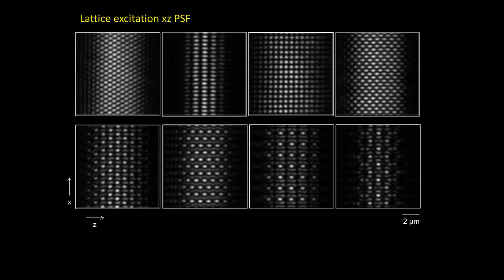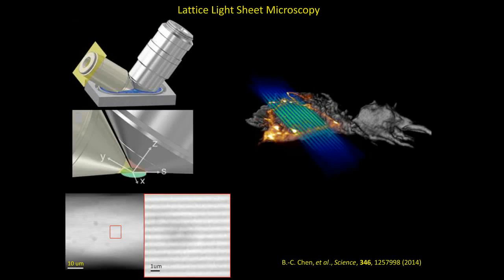And these are very good for structured illumination, because we know structured illumination needs certain frequencies, and these are all the frequencies from the lattice pattern, which is very good for structured illumination super resolution.